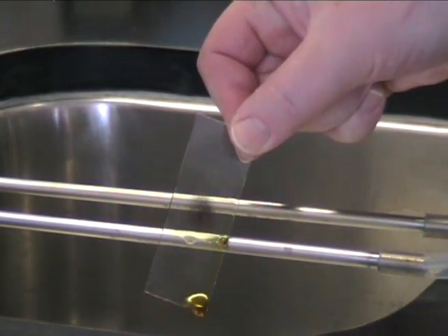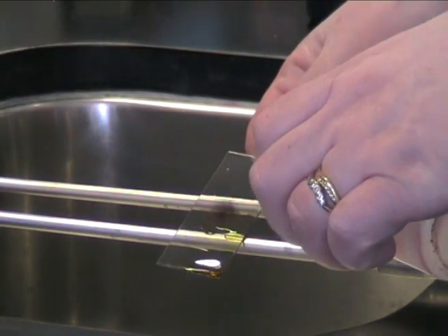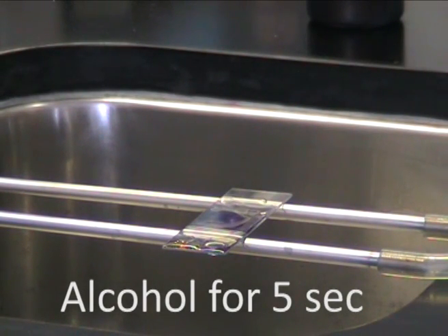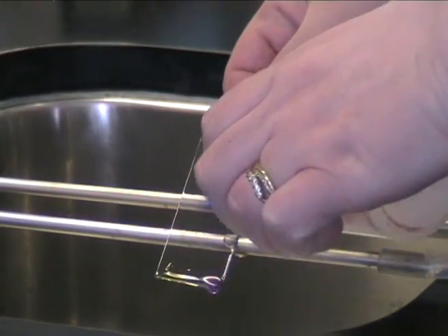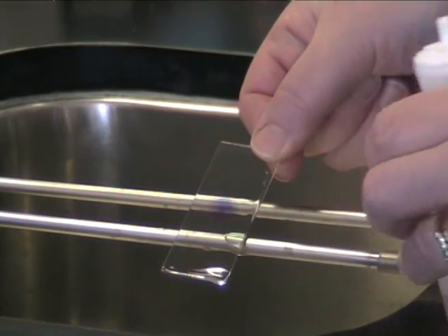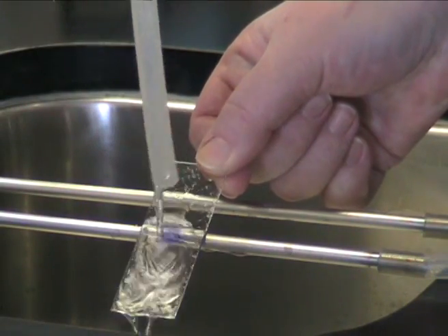Pour off the Gram's iodine and use alcohol to decolorize. Tip some alcohol onto the slide and leave for five seconds. Tip the alcohol off and continue to wash with alcohol until the washings are pale violet. Once you've done this, wash immediately with water.